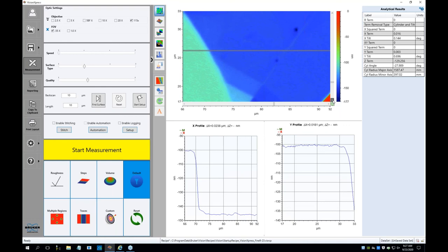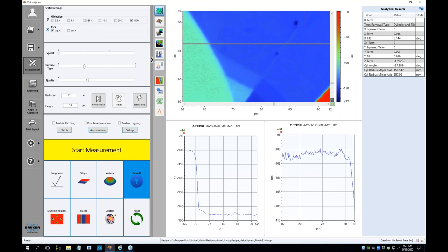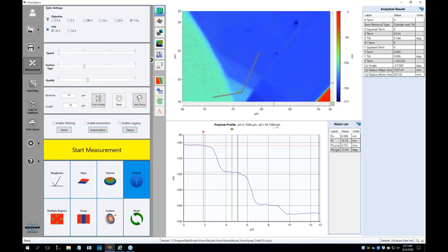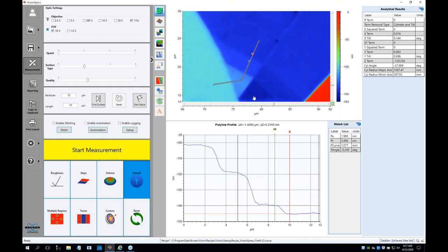In that case, we can look at averaging there. What we see here vertically is a change of 16 nanometers in optical path difference, or down to that one, we can start to see just a few nanometers. And you see how well the steps are determined, such that we can really look for very, very small differences, like over there, for instance.